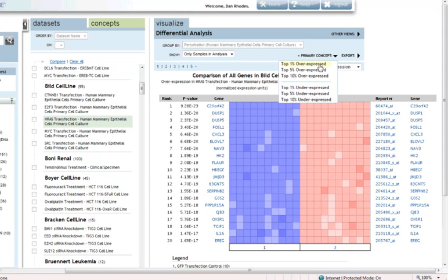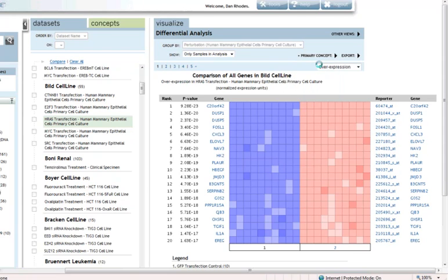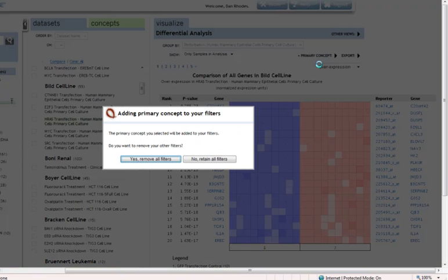I'm going to take the top 1% of genes most overexpressed by HRAS transfection and use that as what we call our primary concept or our query concept for mapping to the Oncomine database.